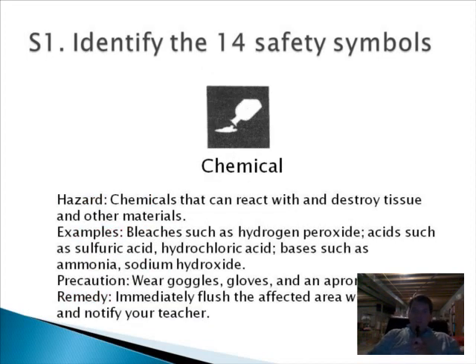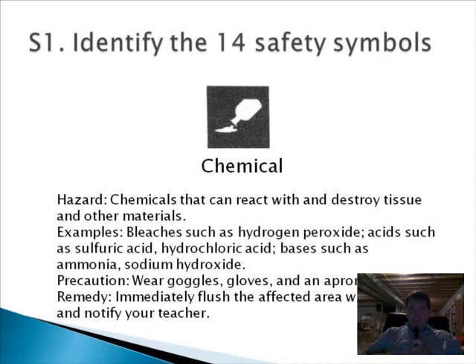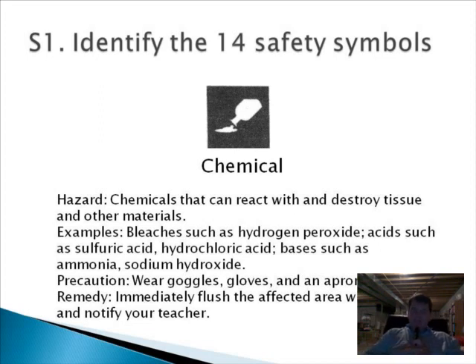The next one is the chemical symbol, which is a bit more serious than the irritant. It means we have a chemical that could cause tissue damage. Things like bleaches such as hydrogen peroxide, acids such as sulfuric acid and hydrochloric acid, and bases such as ammonia and sodium hydroxide could cause a burn to the upper layer of your skin. The most sensitive tissue is your eyes, so definitely wear goggles. Gloves and an apron to cover your clothing are also good. If you get some on you, wash it off with plenty of soap and water and let the teacher know.